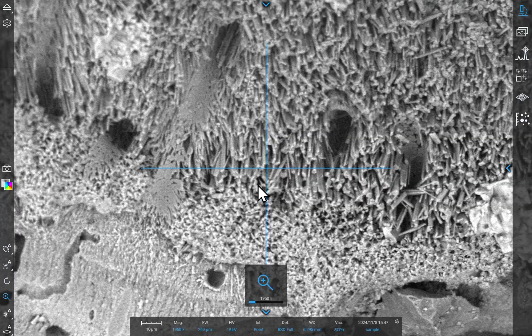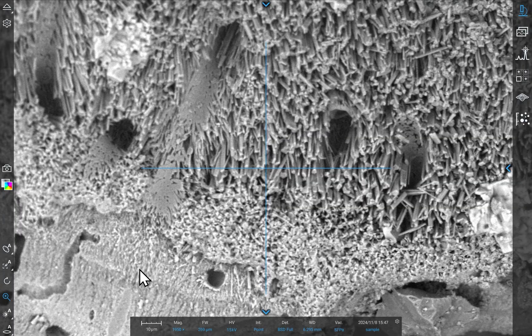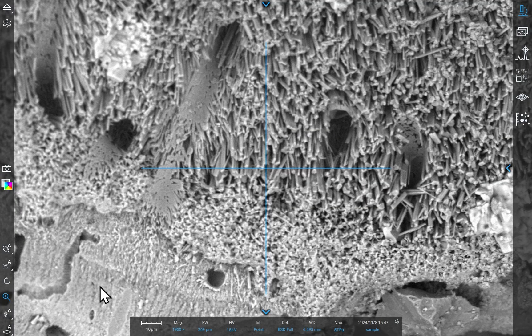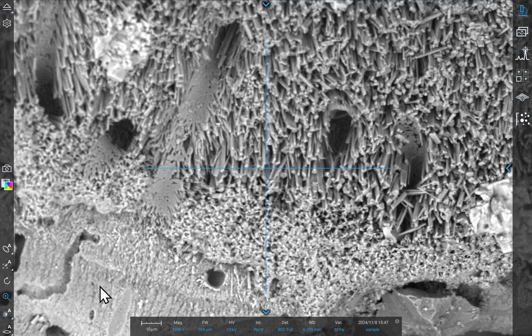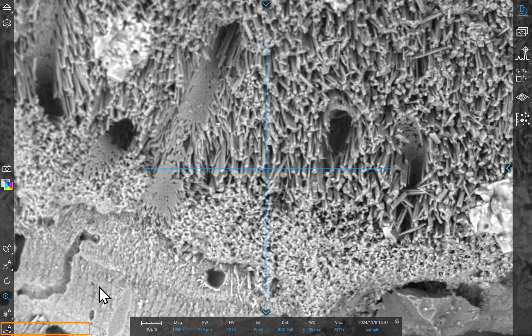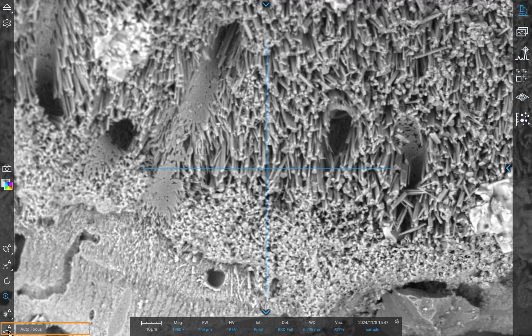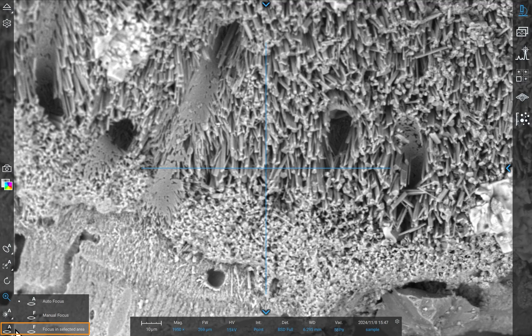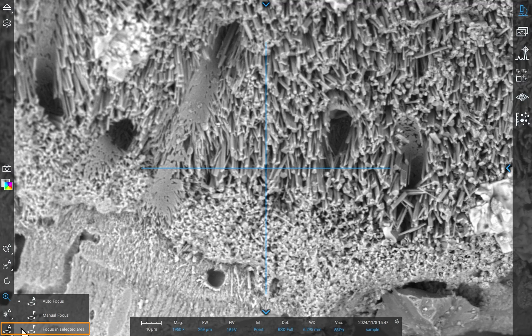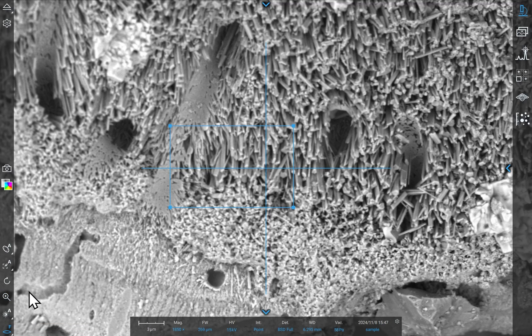Now you're ready to fine-tune. To select an area for manual focus, right-click on the Focus icon in the left toolbar. Then select the Focus in Selected Area option and the Reduced Area Scan box will appear.